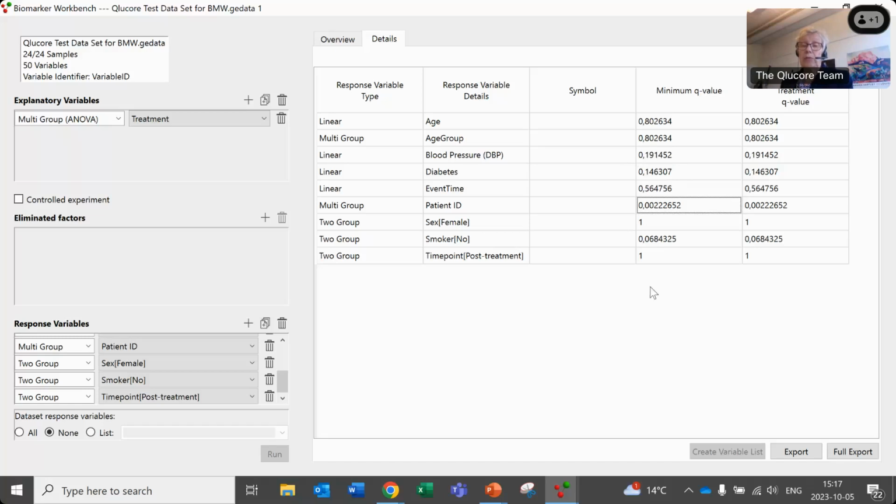So this gives me information that there could be other signals in the data set that affect my result. What I'm looking for is which genes are good at separating the different treatments from each other. But it could be that smoking and diabetes and maybe blood pressure also have an impact. So this is very valuable information. So you can now go back to your data set and try to establish how big this signal is, and whether I can do anything to compensate for that.